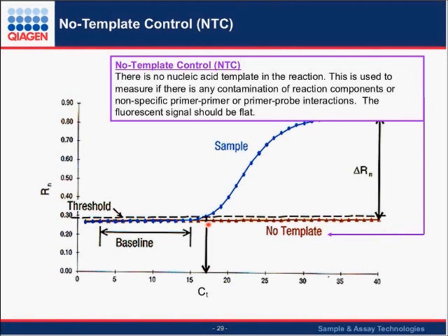You can get little bits of DNA that appear because you need to be extremely careful in your laboratory not to get extraneous amounts of DNA into a tube. It can come from your hands, it can come from the air, it can come from another tube. So you control for the presence of gross cross-contamination by making sure that you have a no template control in every one of your assays, so that you should get a flat baseline saying that you have no contamination there. Okay?